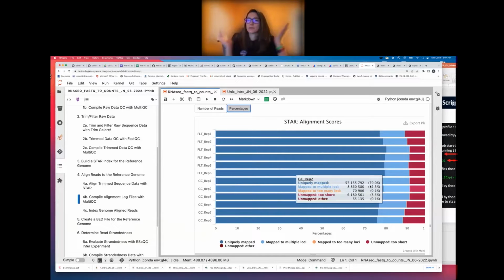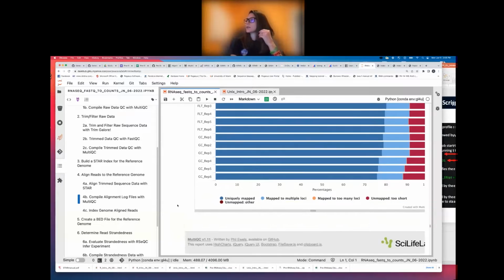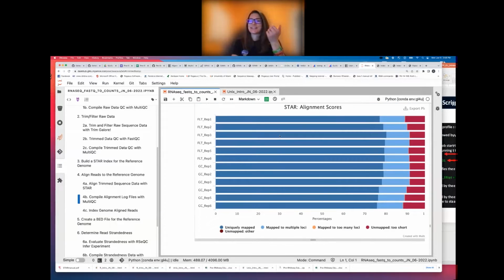to ribosomal. It could map to multiple locations because of the highly repetitive regions in ribosomal RNA, so something like that. So if this isn't over 70%, again, for well-annotated genomes like the mouse, I'll go back and look through some of the previous data and try to identify a reason for that. So pretty short, that's actually it, right? So this is all the information that it's graphing and comparing from the log file for each sample.